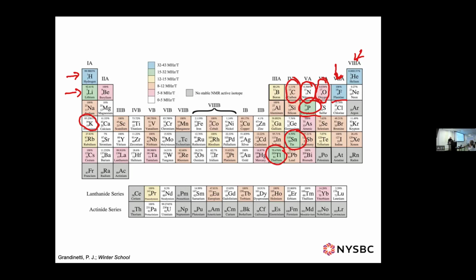I just want to reinforce that with one of the papers that I read and recommended, though not unless you read some of the more basic stuff first. It's a consideration from somebody called Pascal Man, who's talking about why echoes are so hard. At some point he says in passing that when people are fitting, don't try to get these angles out of just fitting your data. He said some of us just set them to 0, 0, 0, knowing that that's nonsense. But I really like what Eric just said about it better, because that's definitely true for CSA, which is harder because it's an excited state property. The angles, they're always right. So just get it from the simulation.